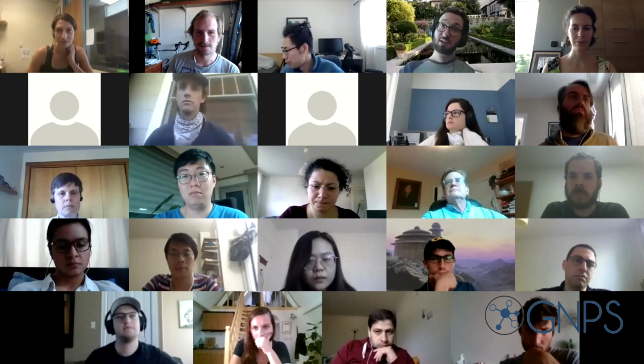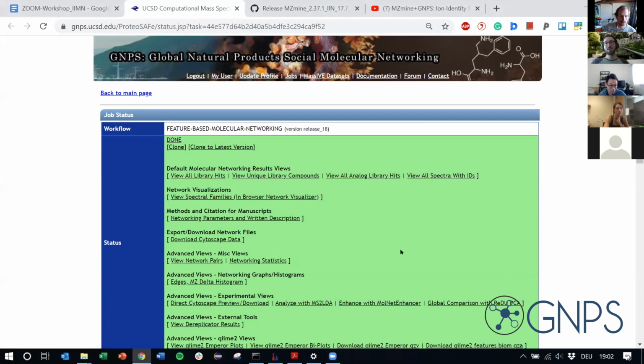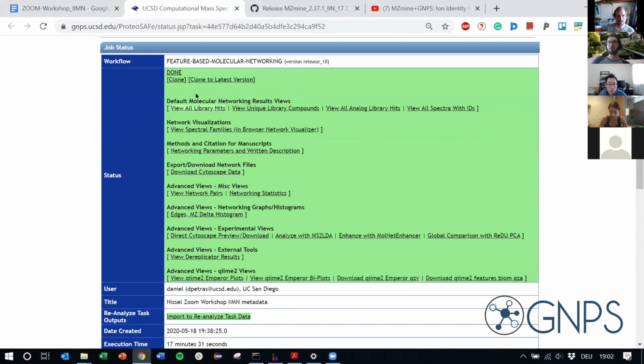Because of a question that came up, I would like to show the GNPS job website once more. Can I share my screen? There was a question whether we can directly compare it to feature-based molecular networking. If you have the job from the last workshop, the feature-based molecular networking workshop, you can use this, or we could just clone the job.